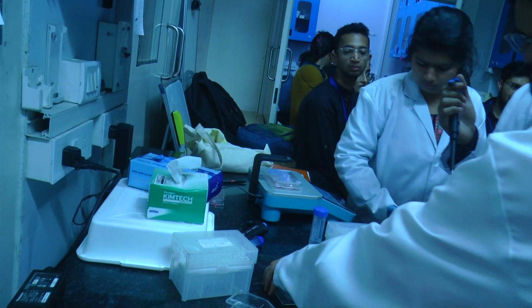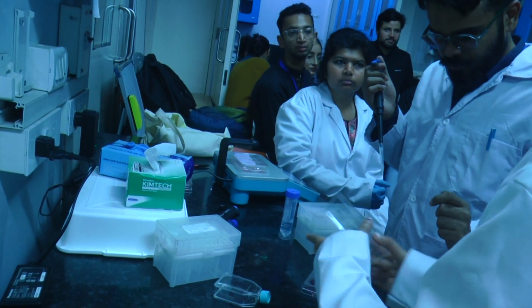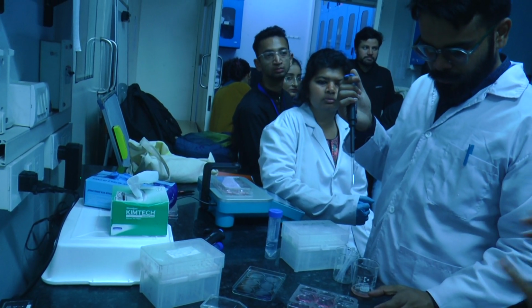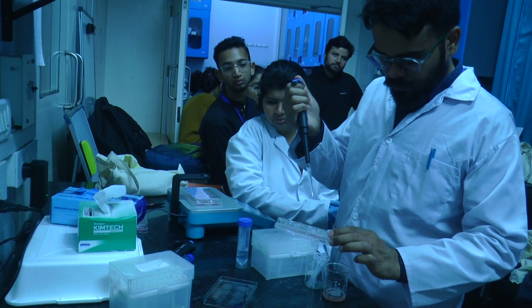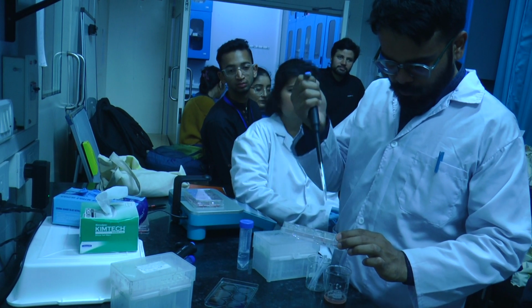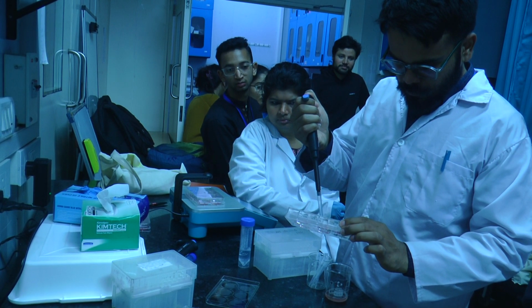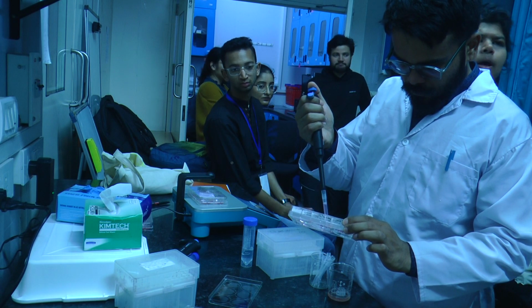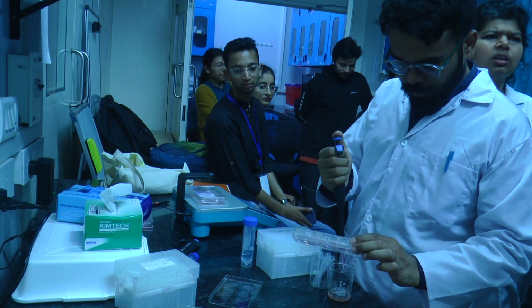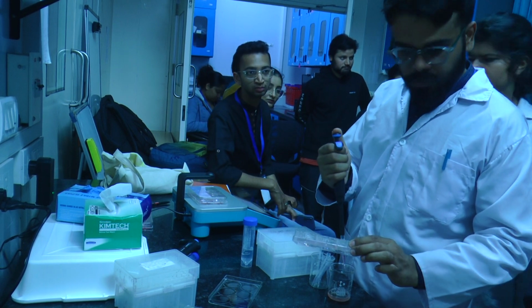Okay, so you can see with this, which one is yours. See this one. Now you pick it up, but slowly, so that only yours goes out, not anyone else's. Yeah, take it out, but don't touch the bottom. Start it. Discard it.